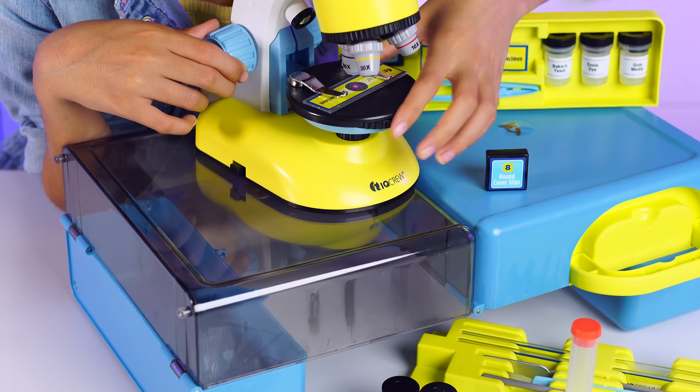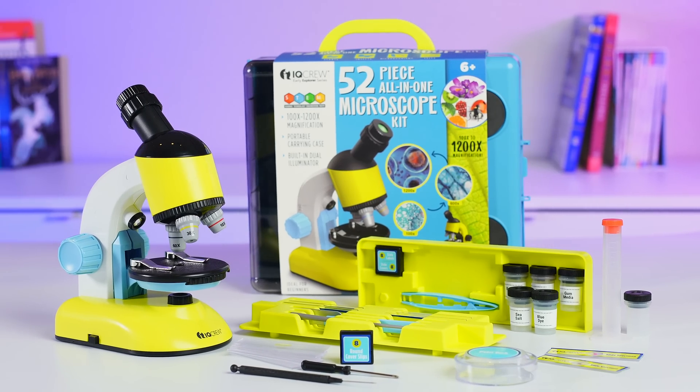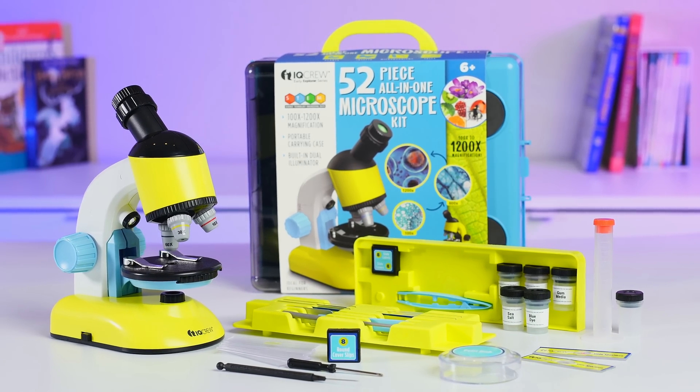This simple, ready-to-go, all-in-one kit allows kids to demonstrate their STEM knowledge. Watch the magic happen as kids explore, learn, and grow.